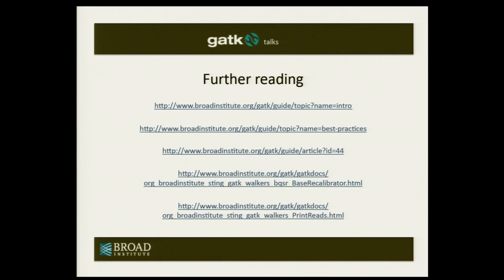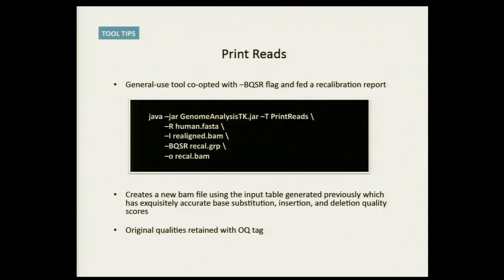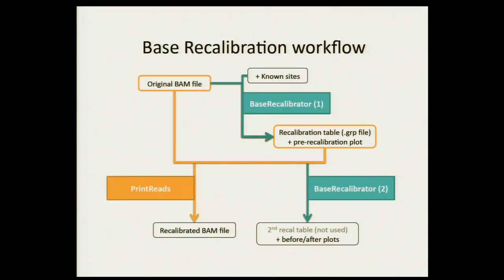OK, what's up, man? So PrintReads also generates those nice graphs? PrintReads? No. So the way it works is the output of BaseRecalibrator is actually what's making the plots. So it creates this report, right? This table. I saw Q17 and it mismatched the reference this many times, or I saw cycle 10 and it mismatched the reference this many times. And then all you're doing to make the plots is just plotting those tables. It's very simple in R. You read the table and plot it. It's like the easiest thing in the world. So that's why this creates the plots.